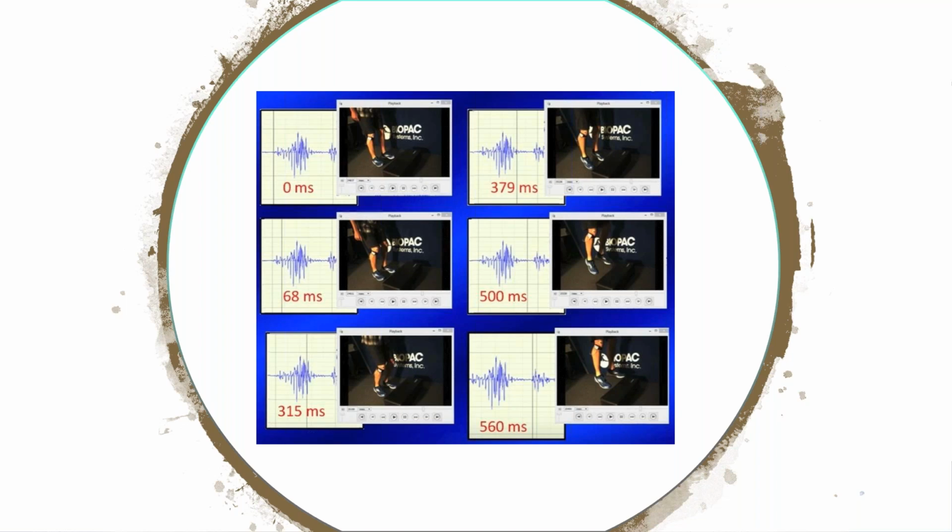The videos that I've shown you, the quality is actually pretty good with these, but it's really meant to be based around subject observations. Normally, I've got the lighting a little bit subdued in here today. We can turn the lighting up. The cameras will handle that no problem. So you get a better view of the participant.